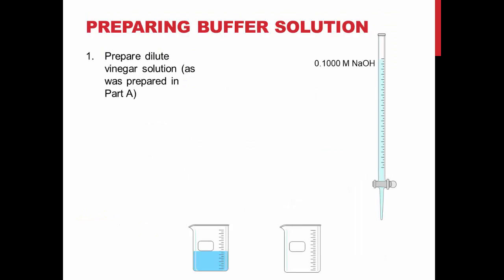To prepare a buffer solution, you will first need to make a dilute vinegar solution the same way you did in Part A of this experiment. Pipette 10 mL of the provided vinegar solution into a 100 mL volumetric flask and dilute to the mark with deionized water.